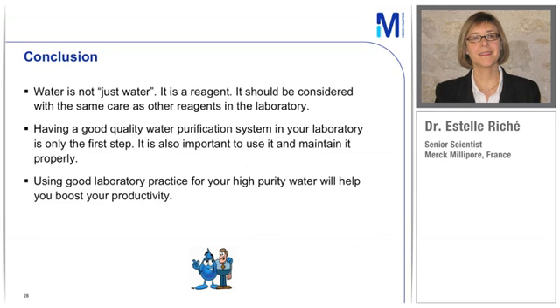So in conclusion, I hope I convinced you that water is not just water. Even though water is used everywhere in the laboratory and may feel like this is a very common solvent, it is really a reagent, and it should really be used in the same way as you would use other reagents, and you should take the same care with your water as you would take with other reagents in your laboratory.